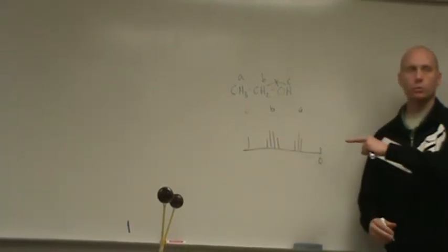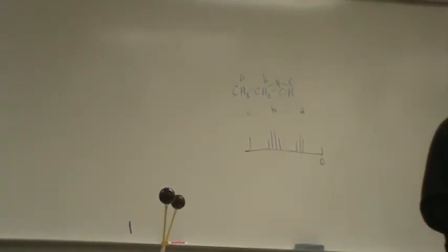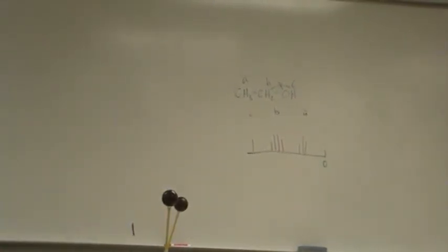Any questions on this one? I want to introduce you to the alcohols because you'll see those, so that you know that the OH is not involved in the splitting. It's kind of an island all to itself. Okay. Any questions on the alcohols?